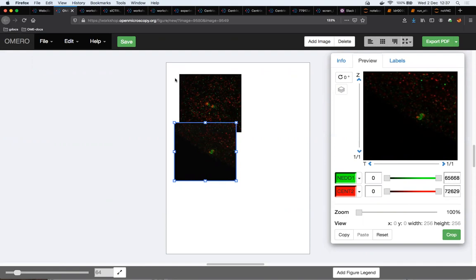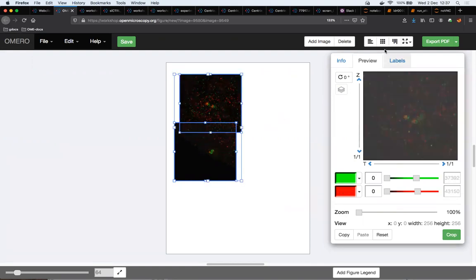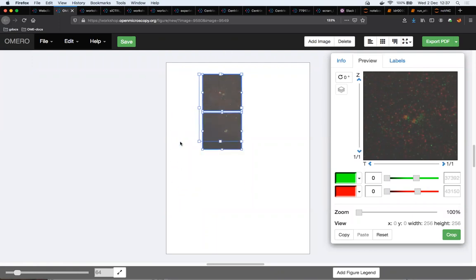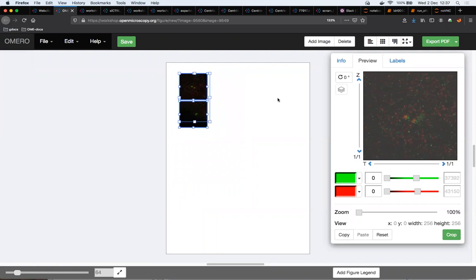So what the OMERO figure actually is? Well, it's a plugin for OMERO.web, obviously. And as I'm doing that, you can do that with me. And it fetches the data on the fly from OMERO. So it remembers which images are contained in those 2 panels. This is not somehow disjointed. It's completely connected to OMERO, and at any time it can come back to OMERO and ask for metadata pertaining to those 2 images.